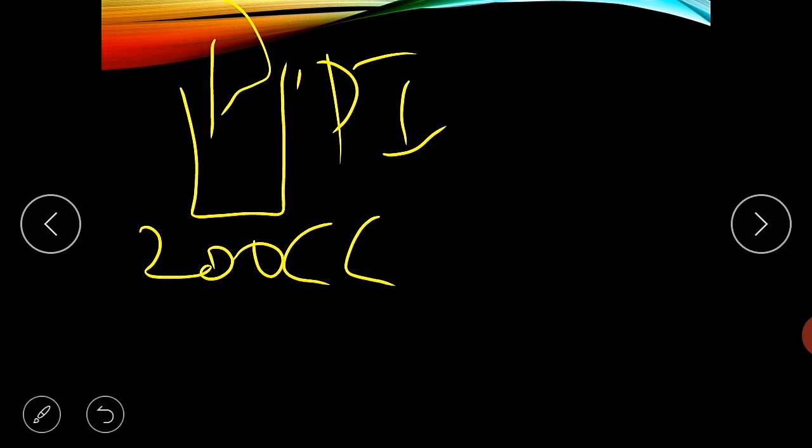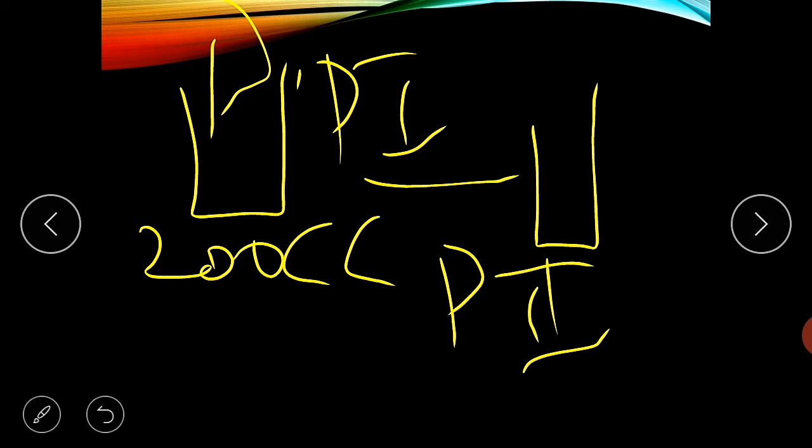Wait for 4 to 5 minutes and pass this soil suspension to pan 2. Then repeat this process 2 more times to ensure that no nematode is left in pan 1, and discard the remaining material. Stir the suspension of pan 2 gently, wait for 4 to 5 minutes, and pour it through the series of 60, 100, 200 and 350 mesh sizes.